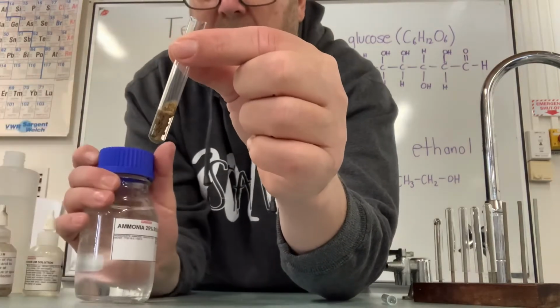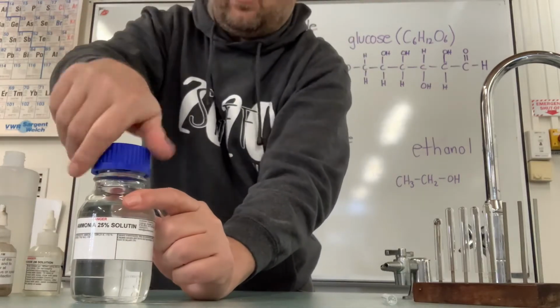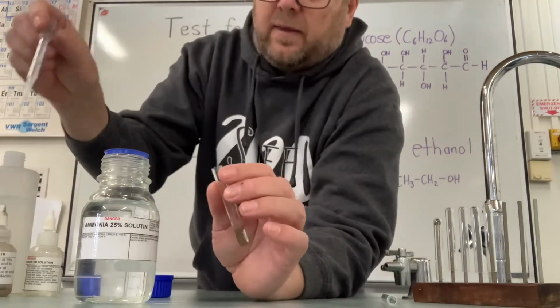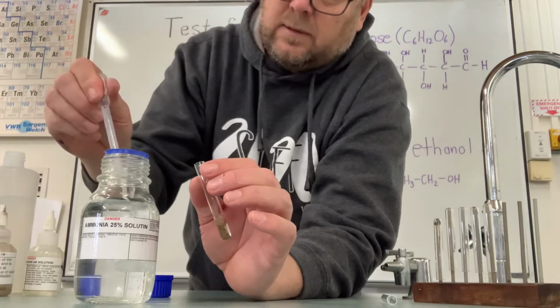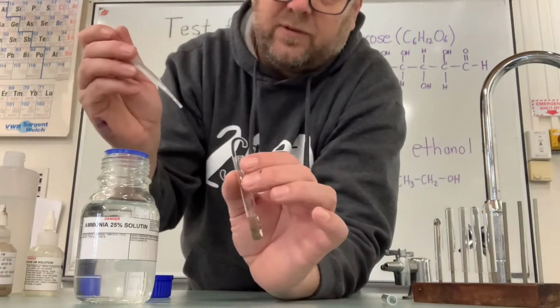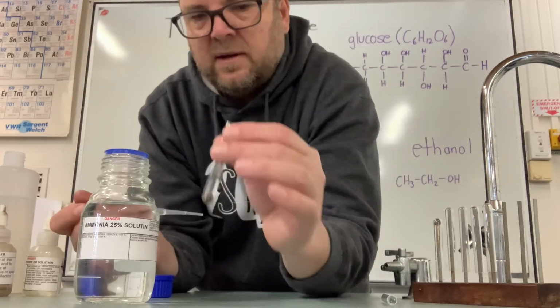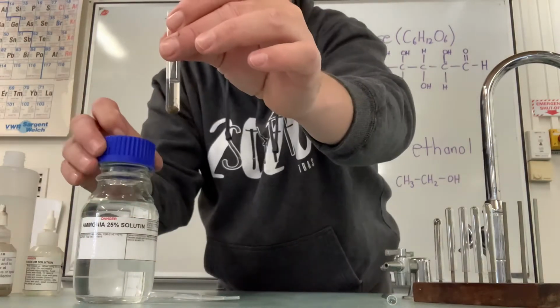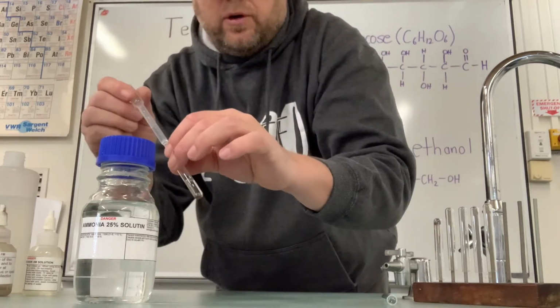Then we're going to take some ammonia solution. Be a little bit careful with this, it's quite strongly odoured, you wouldn't want to get too big a breath of this. And then when we get a bit in there, if we add just a few drops of this, what we should hopefully see, the odour of that is quite strong. Let me just put the lid back on. Add a little bit more ammonia.